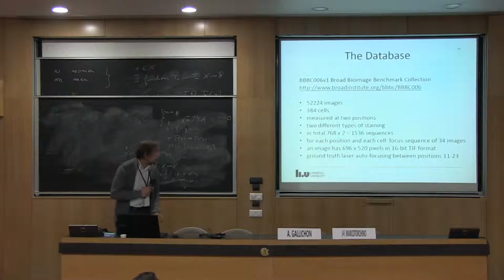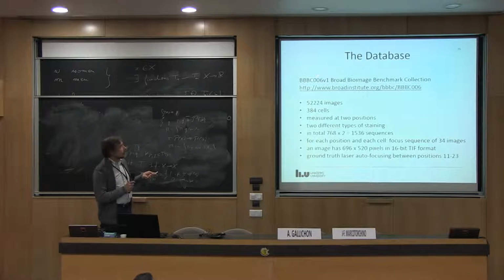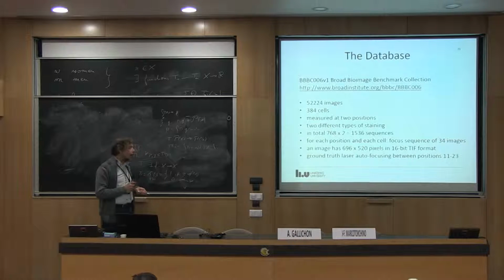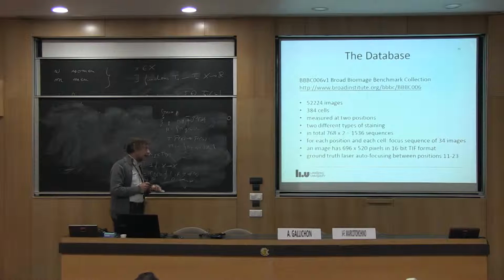This is the reason why I chose microscopy images, because there is a database which is really big. You have 50,000 images. You have 384 cells.